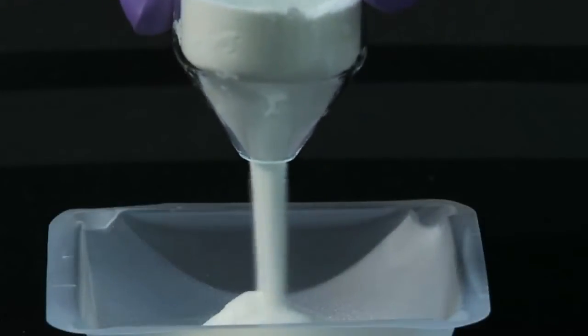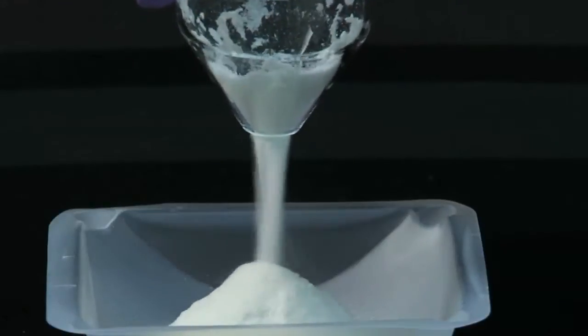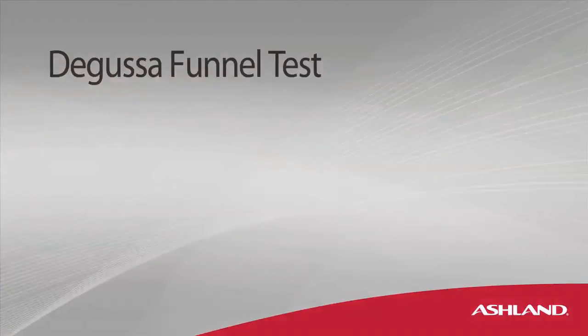To demonstrate the flow of Directly Compressible Benicel Hypermelos, we use the Degussa Funnel Test, an older but visually impactful test of powder flow.